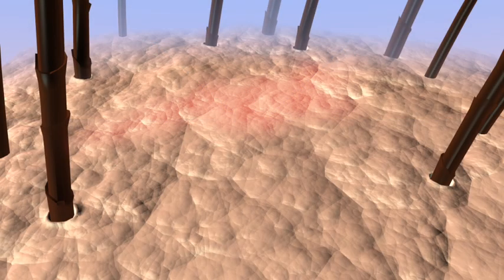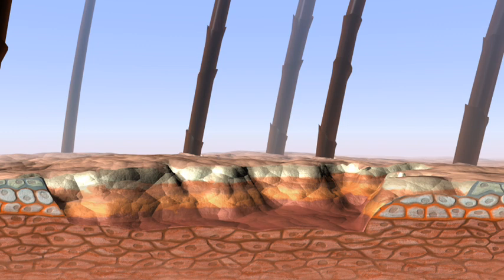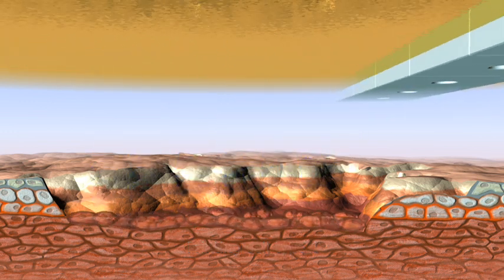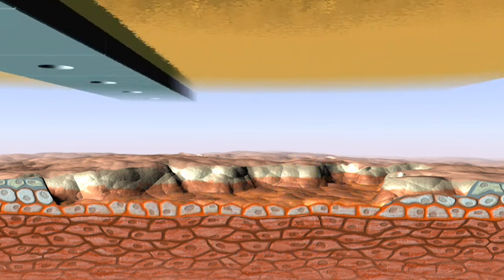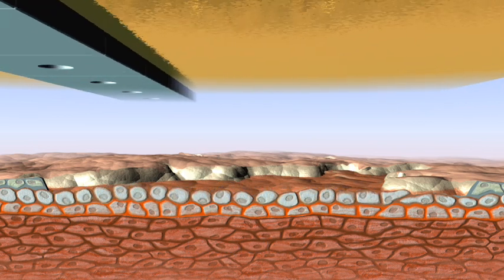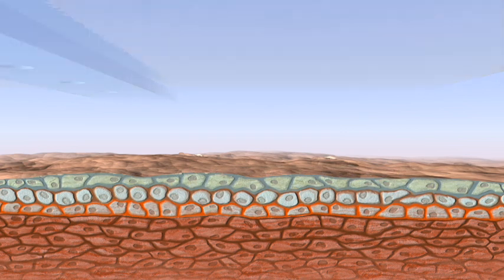Printing of living cells can allow for development of novel wound-healing strategies. Living cells derived from the patient could be deposited at the site of injury. Different types of cells could be built up in sequential layers. Such a strategy could accelerate healing or reduce trauma after surgery.